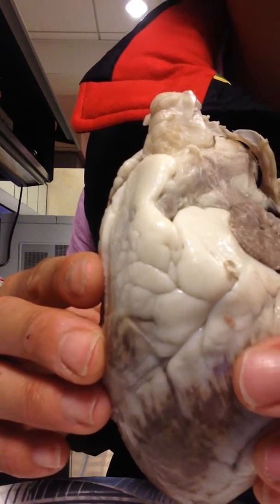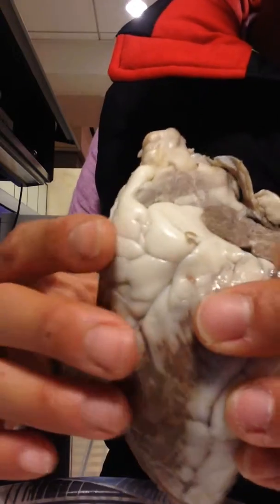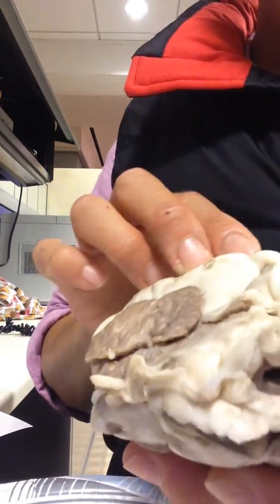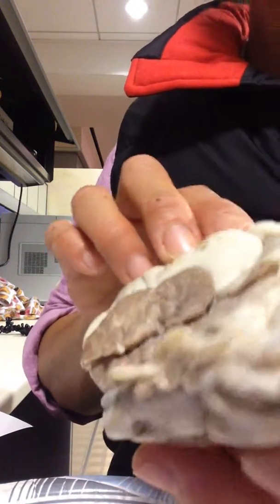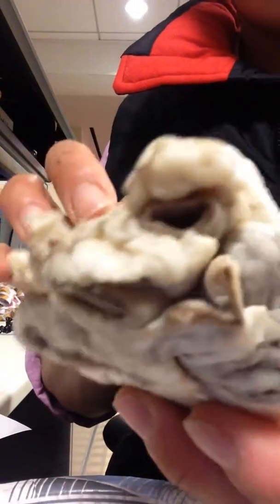And then right and left auricles. So the auricles are here. So this is the right auricle. And then the left auricle is right there.